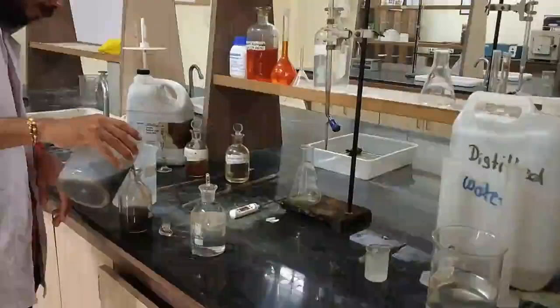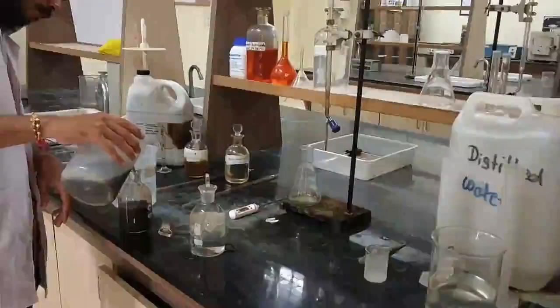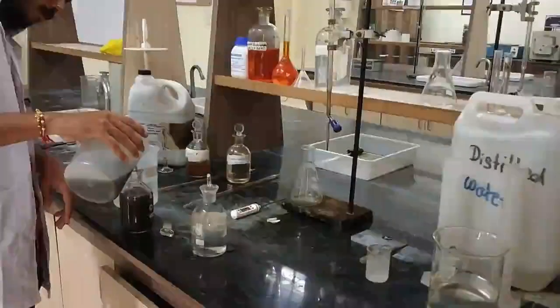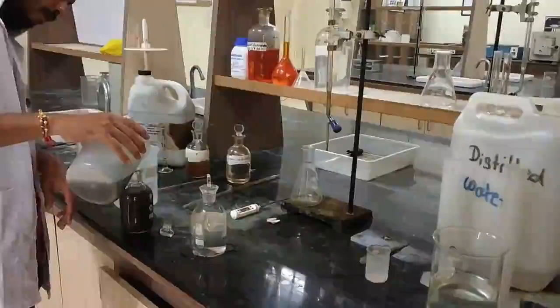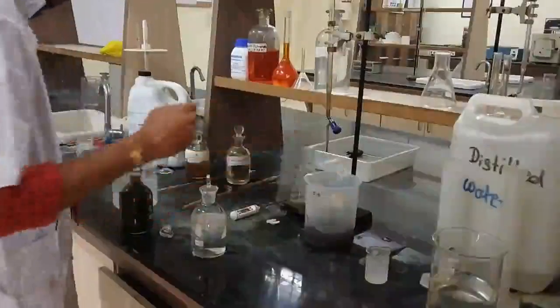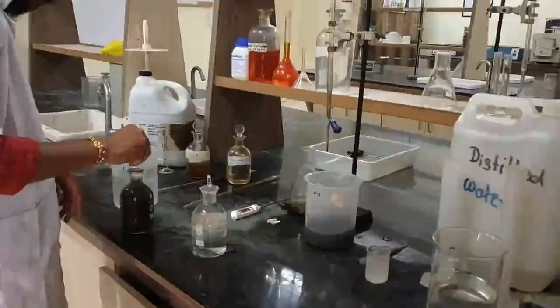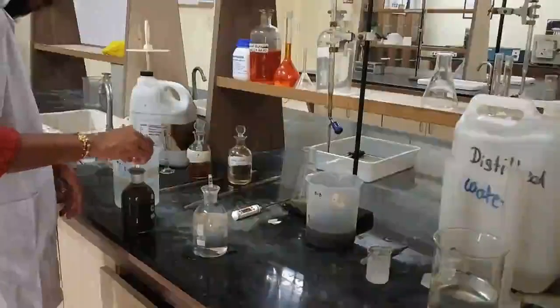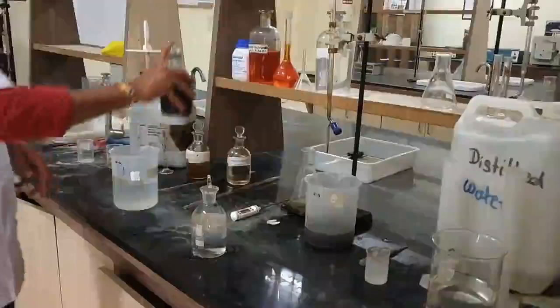You can observe the color of the sample that we have. It contains a very high organic load. We'll be stoppering this bottle. The excess sample is drained off.